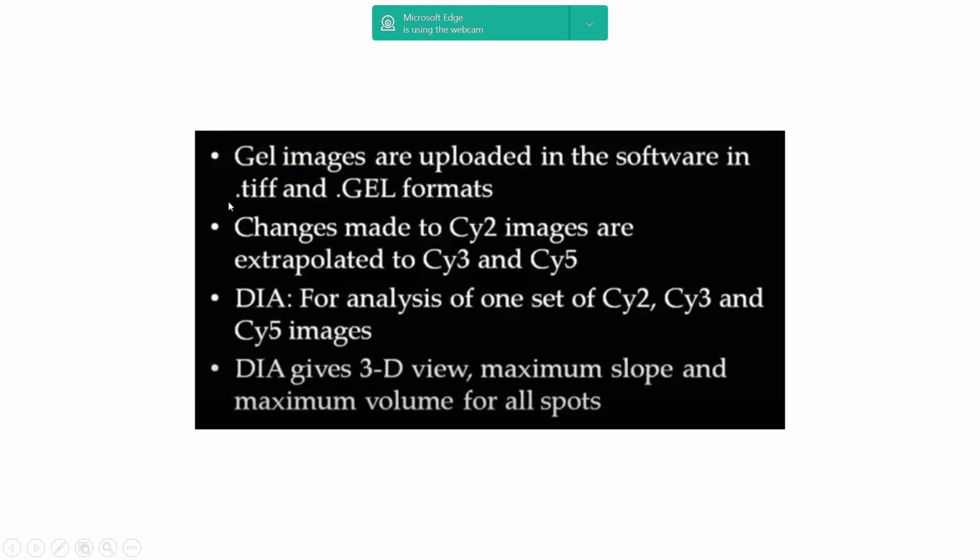Generally, the gel images obtained are of this format, and gel to gel variation will be minimized by visualizing all of these three images at different excitation and emission wavelengths.